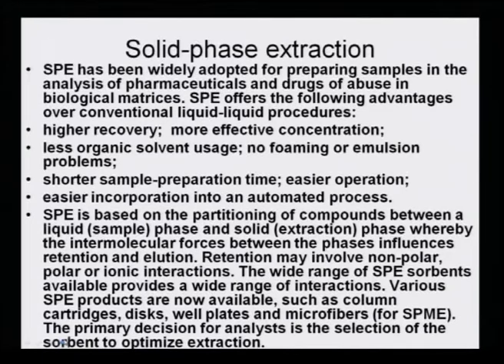SPE, or solid phase extraction, offers the following advantages over conventional liquid-liquid procedures, because as I mentioned earlier, every new method must have an advantage over the existing classical methods, otherwise there would not be a need for a new method.